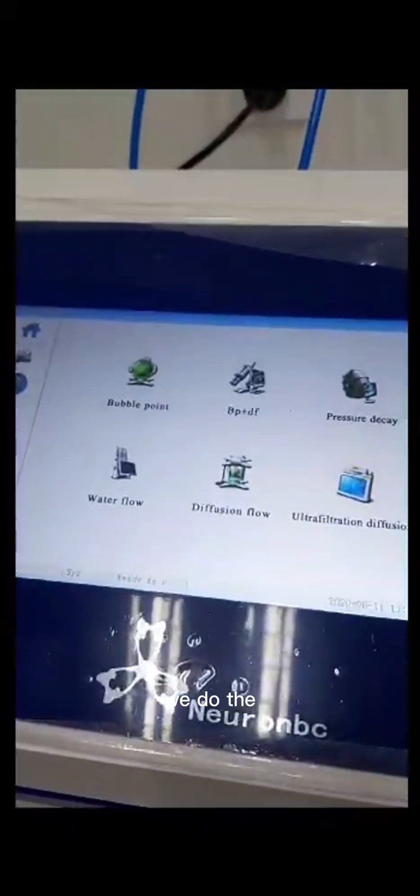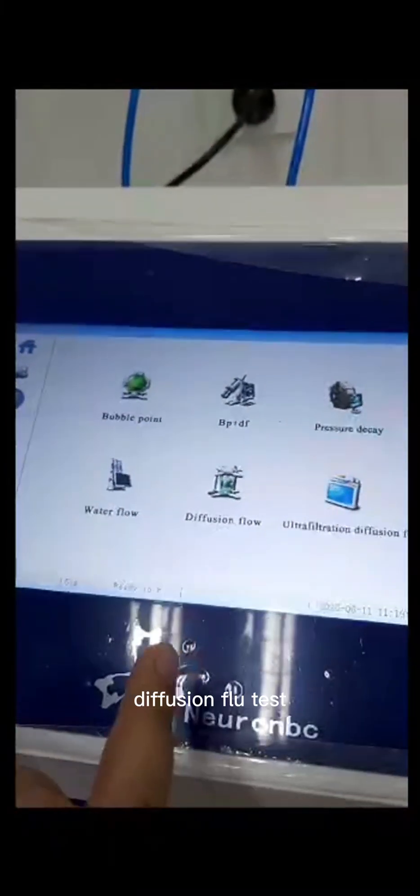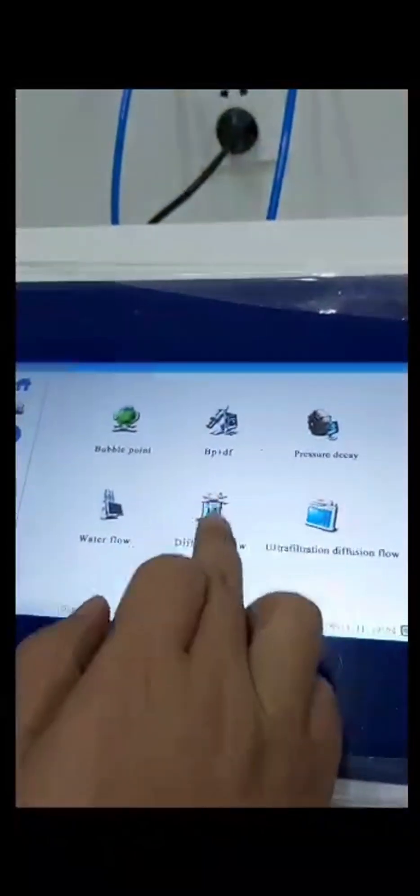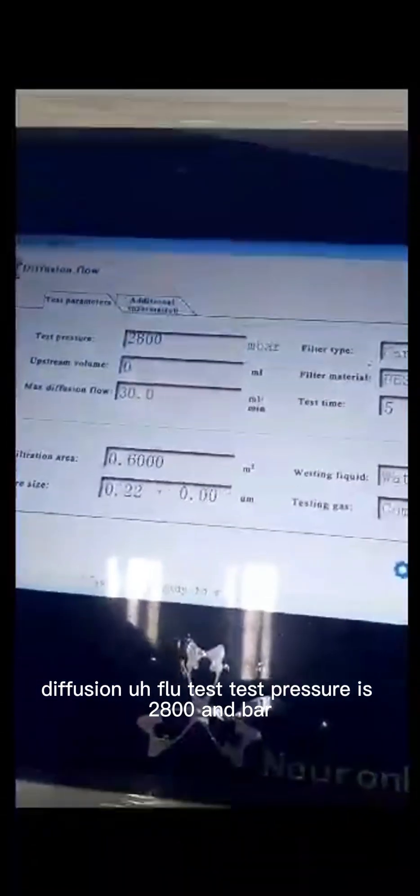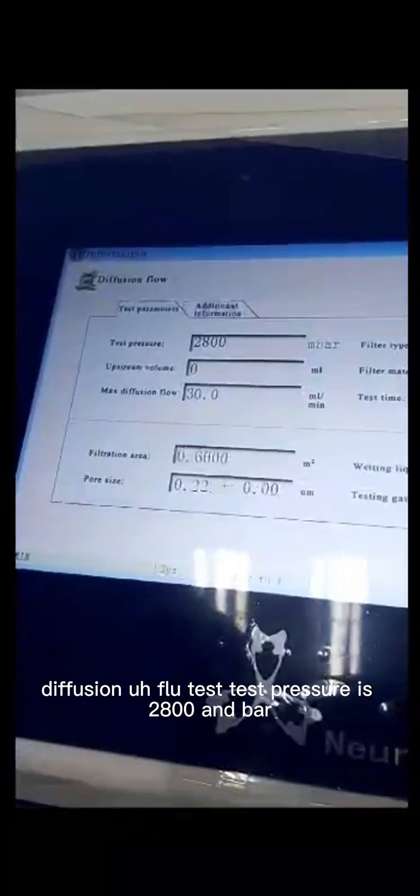Now we do the diffusion flow test. Diffusion flow test. The test pressure is 2800 m bar.